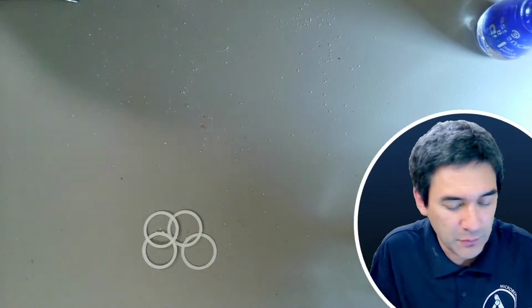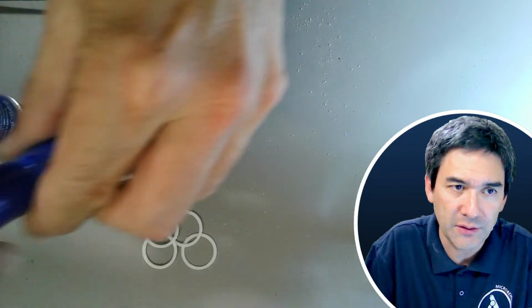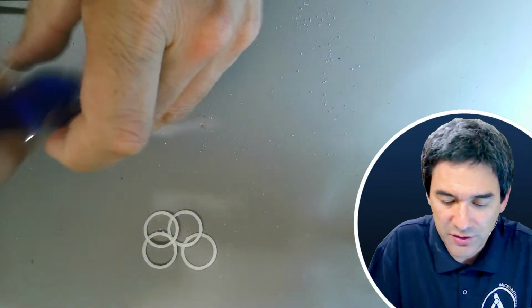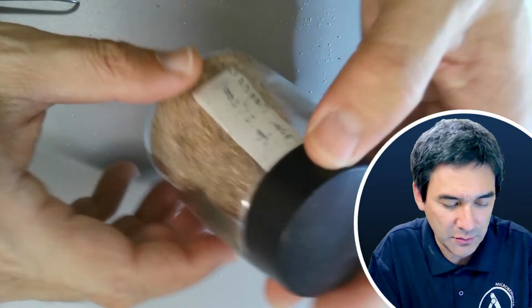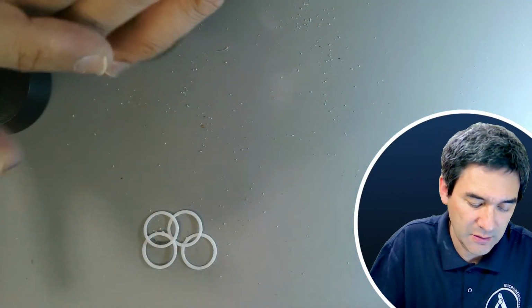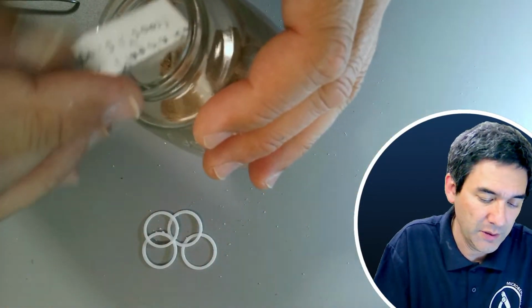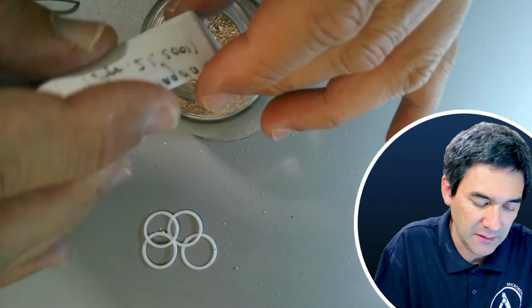And in this case, I'm not going to make a slide now, but I'm just going to take the container and directly put it under the microscope. The next one here is, I don't know. I don't have to open it. Just a second, let me quickly read it. I also put a little sheet of paper in here with a description, date and everything.